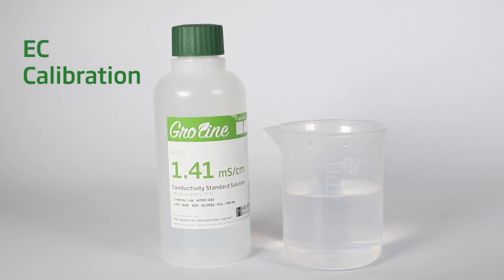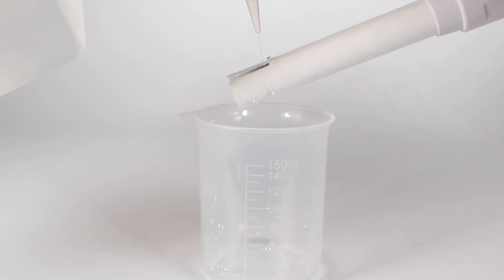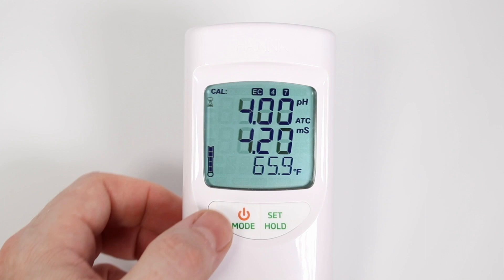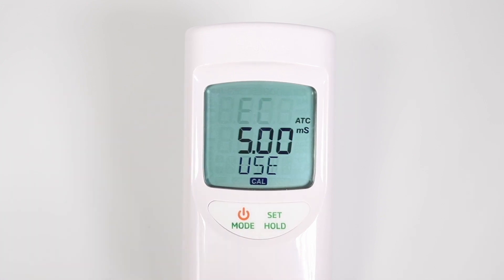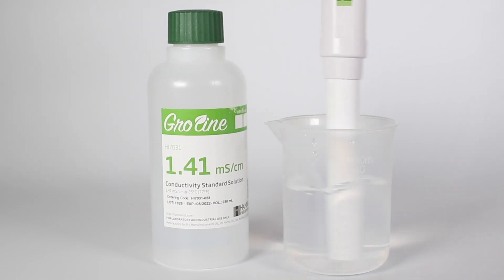Now let's calibrate for EC. Rinse your probe for 10 seconds with distilled water to dissolve any KCl (potassium chloride) crystals left from the storage solution. Tap water is okay if distilled is not available to you. Hold mode until EC standard appears, then release the button. Immerse the probe in the 1.41 millisiemens or 5.0 millisiemens calibration solution.